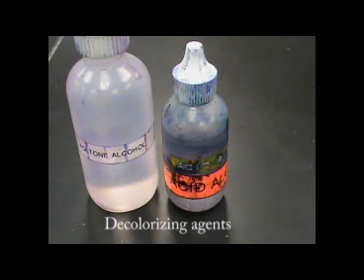Some of the staining techniques you'll be using throughout this course will require the use of more than one stain. Most often, in the case of differential staining, or those techniques using more than one color, a decolorizing agent will be used. Those that are common are acetone alcohol, used in the gram staining process, and acid alcohol, which will be used later in the acid-fast process. Water may also be used as a decolorizer or simply as a rinse.